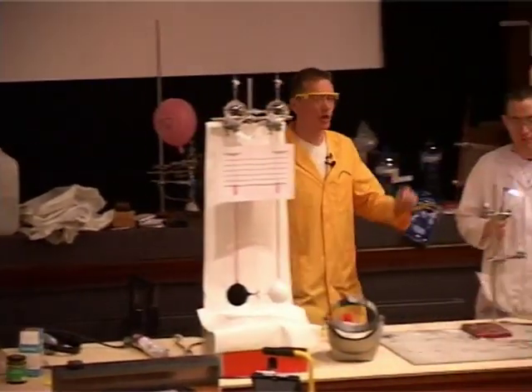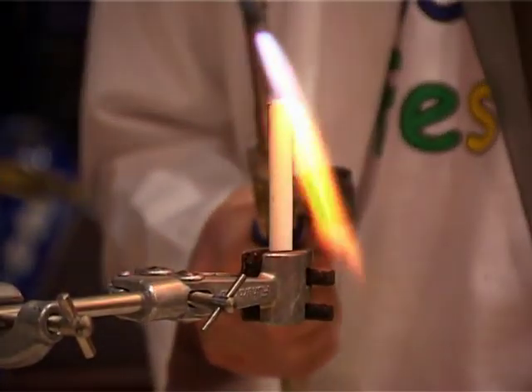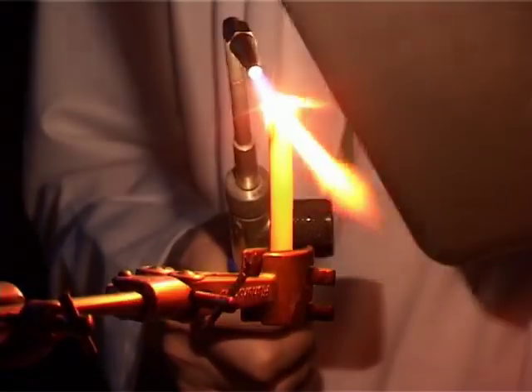We've got the hydrogen and oxygen light here, and we're going to heat up, well, this is a stick of chalk, exactly the same sort of thing that your teacher would use. So we're heating it up. If we have the lights down, please.